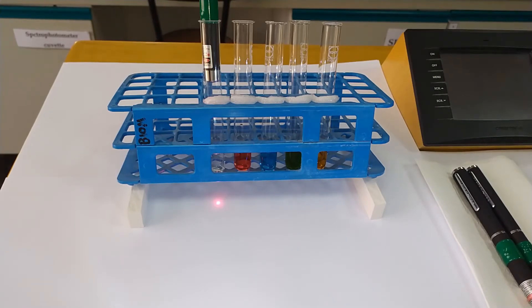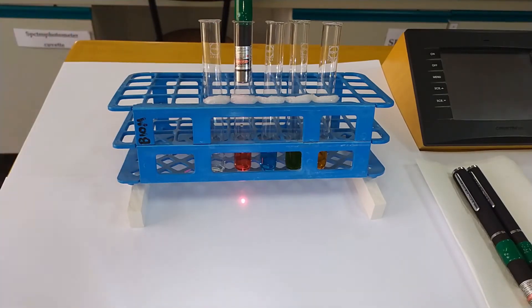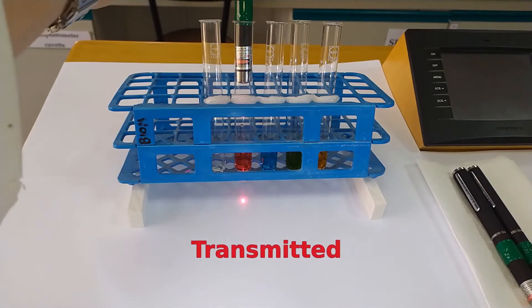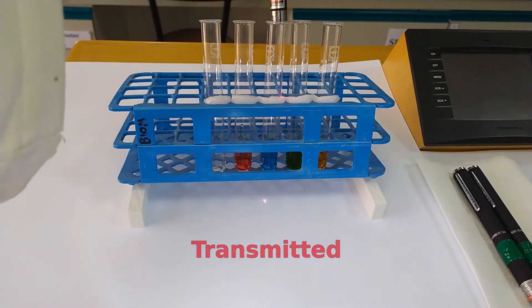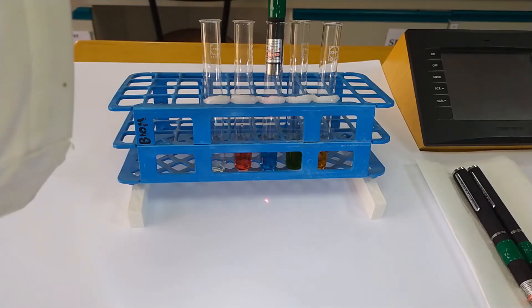Let's now transfer this over to the tube containing the red dye. And here again, we have no problems having the light pass right through the sample. We could say that it is transmitted by the sample. Let's try now with the blue dye. And you can see that the red spot is smaller, but it's still there. Some of the light is being transmitted by the sample, but some of it is being blocked.